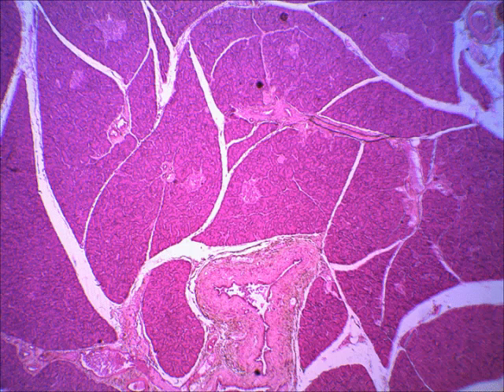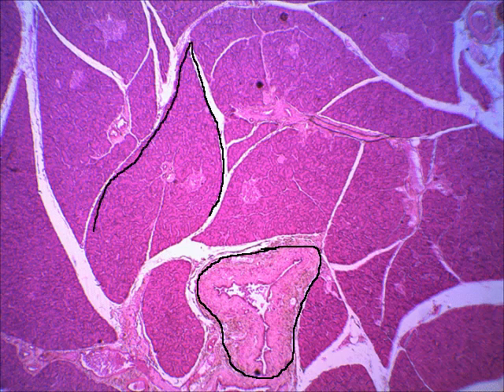And here you're seeing, if I outline, this is the big pancreatic duct. All right, that's a duct. And then you're seeing lots of these little lobes or lobules of the pancreas. There's one. There's a lobule of the pancreas. There's several lobules, and they're separated from each other. You see the little spacing around them.